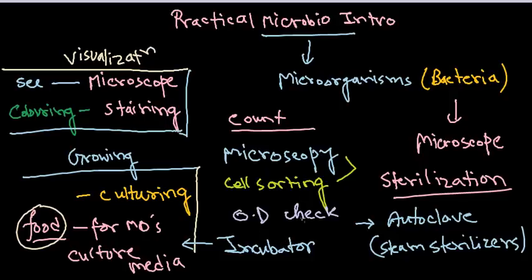These are the very basic things. You should require all of these things for the process. And also after sterilization, what you need to do, you need to culture. For the culturing process, you require another machine where you must do all those transferring tasks, because you know air is filled with microorganisms. So if you are doing this on your simple working desk, in open air, it will catch a huge amount of contamination. So sterilization won't play a vital role in that case.